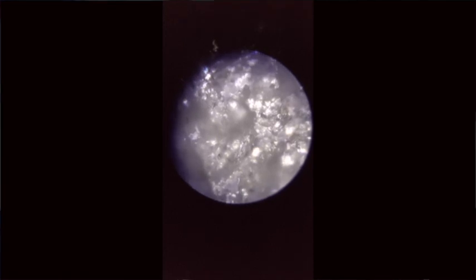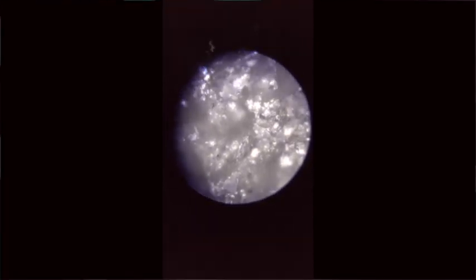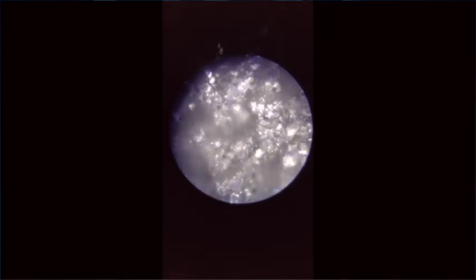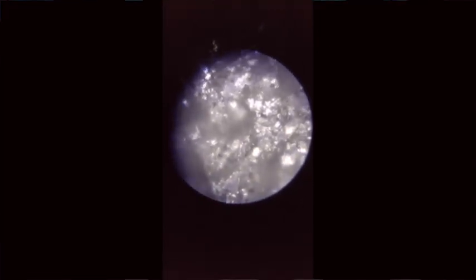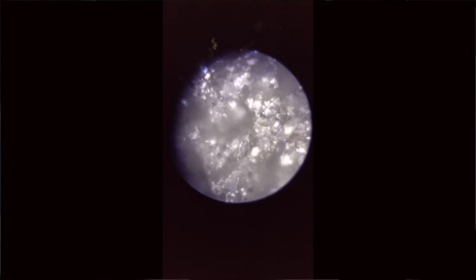That is because it is sugar. Wow, I am speechless. This looks like small diamonds. If that's how sugar looks, like small diamonds, my father can literally give this to mama and say that this looks like diamonds, you can take this only.